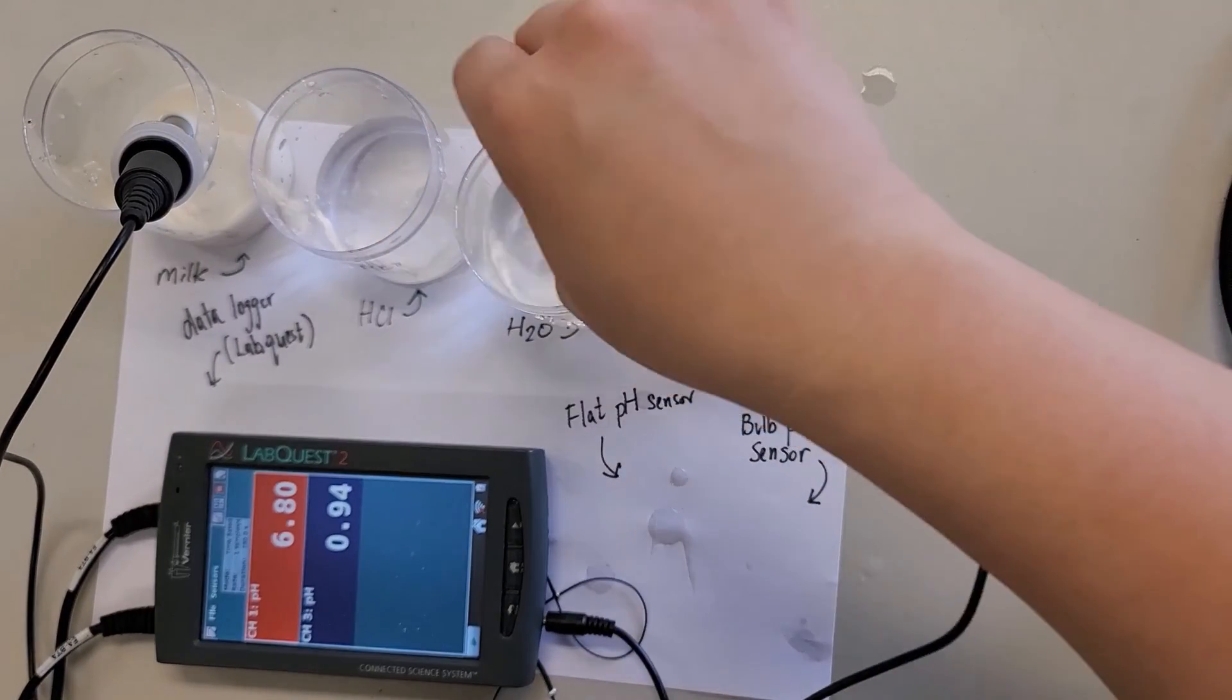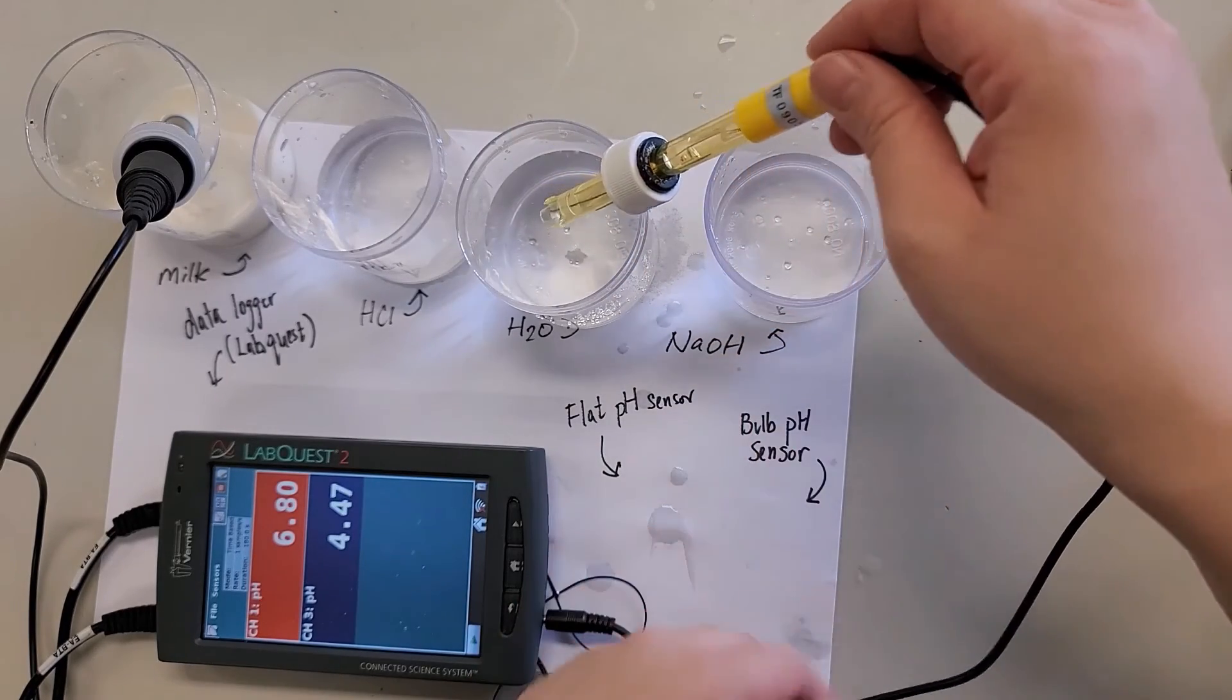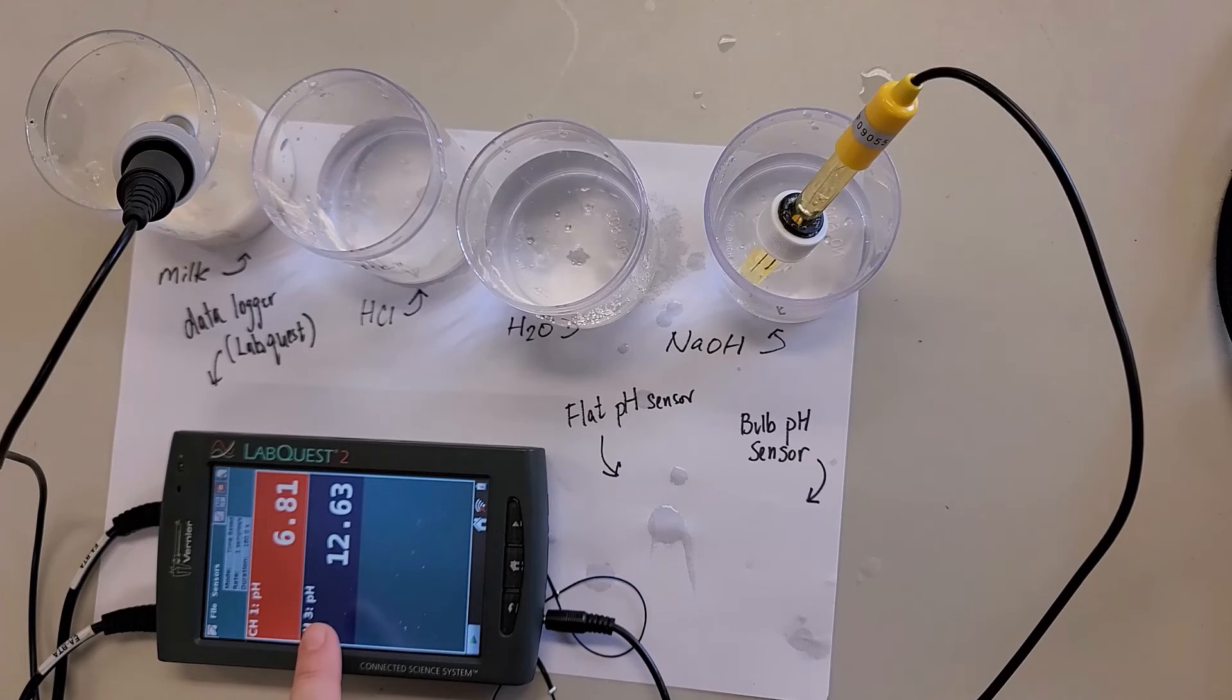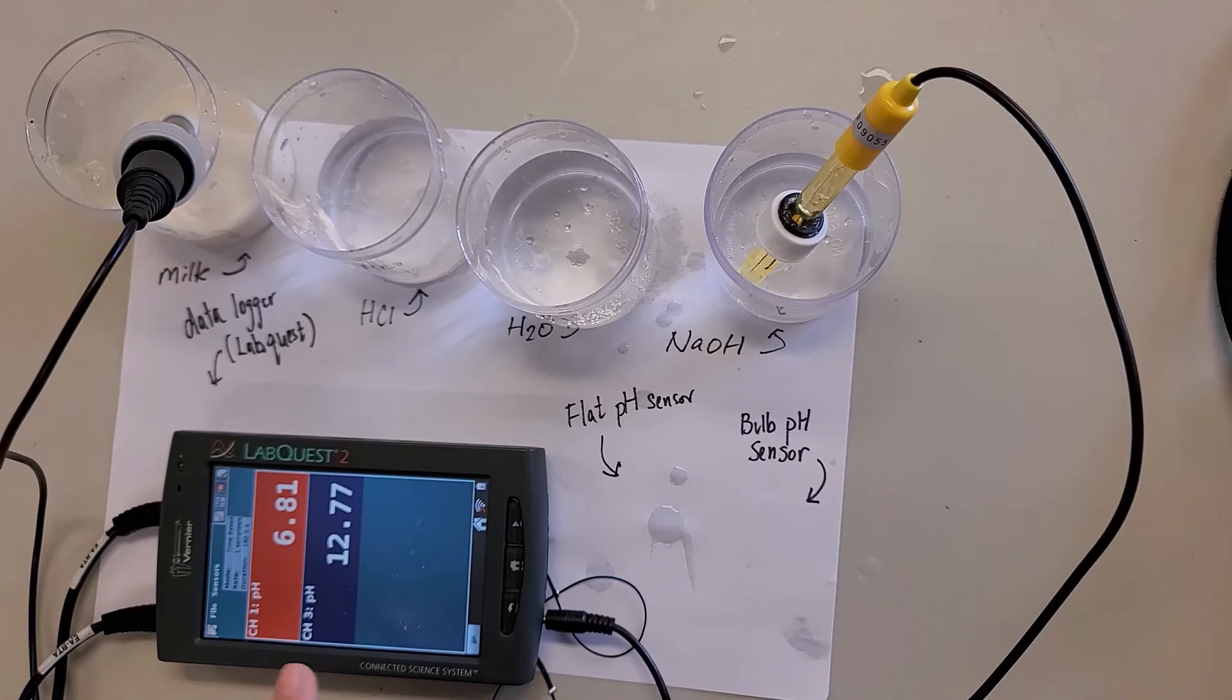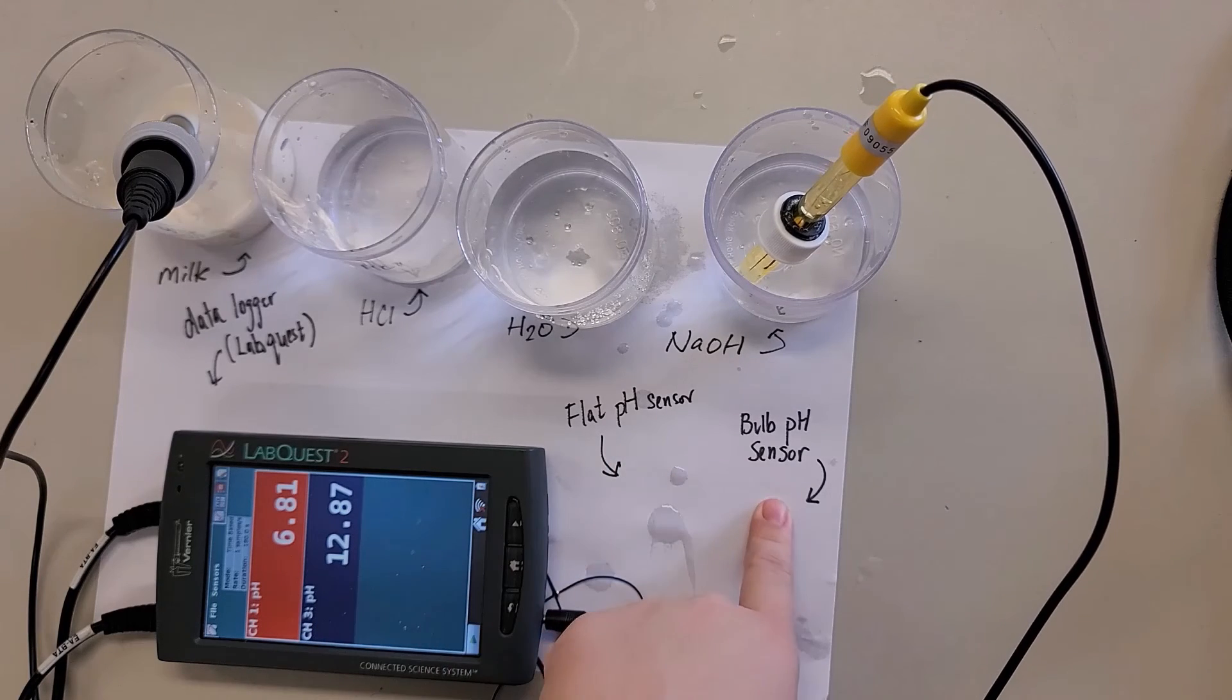And then let me just rinse with water again. And then try with alkaline solution, NaOH. Now it's rising very rapidly as well. Can you see? This one is like 12 point something. So that is how we use the flat pH sensor and the bulb pH sensor.